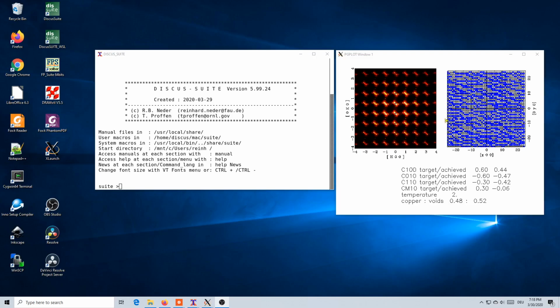For example, here a simple two-dimensional crystal with blue and white atoms which undergo a certain short-range order, and this short-range order then causes, if you calculate the diffraction pattern, this diffuse scattering to appear here, broad maxima of diffuse scattering roughly along the 1, -1, 0 direction in this diffraction pattern. And that is what you can do with this program: simulate these crystal structures, simulate then the diffraction pattern and compare that to the experimental data.